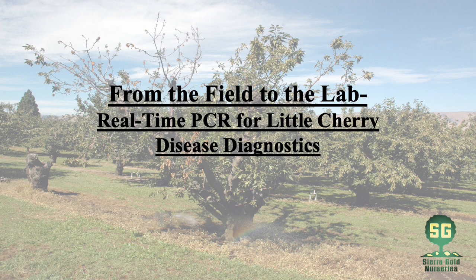In the past few years, we have worked hard to develop and optimize the state-of-the-art tools we need to sample and test our budwood orchards in-house for little cherry disease. Now, some of you might be curious about how here at the nursery we are performing these tests, so I thought I would take you through how we are using cutting-edge technology to ensure our trees are disease-free.